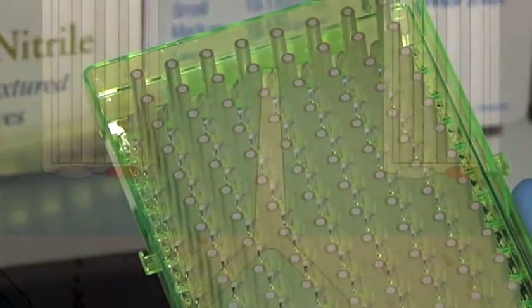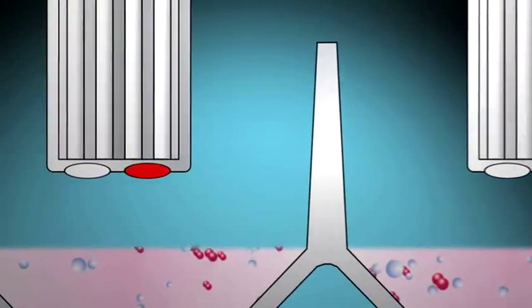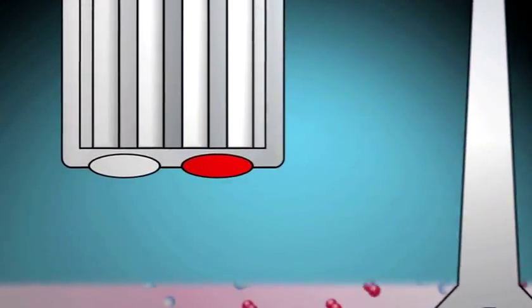The sensor cartridge has either 24 or 96 plastic sleeves. At the bottom of each of the sensor sleeves, embedded in polymer, are two fluorophores.